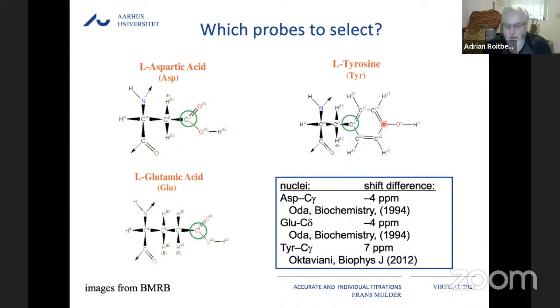Thank you. And then the other question is, when you did the unfolded state of GB1, right? This is unfolding with urea, or is it pH unfolded? So Sarah Lindsay just produced the half proteins, just the first half of the sequence and the second half of the sequence. Okay. And it's such a small protein it cannot fold. It will not fold into anything. And then what kind of chemical shifts did you get versus reference for the unfolded, or are they basically very close to the reference?